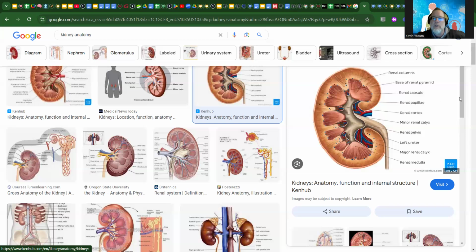And really, all I'll need to do is show you the pregnant rats and the male rats, so you can dissect the reproductive systems, and we'll pull out the rats and see how many babies are in there. And that's probably where we'll finish. So the whole thing will take 2 hours, 20 minutes.